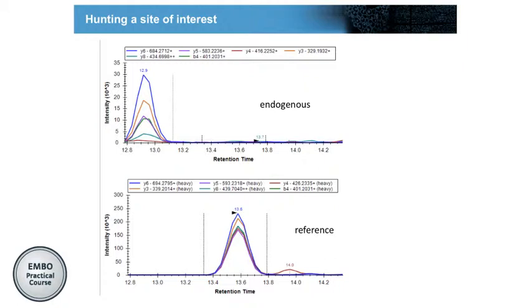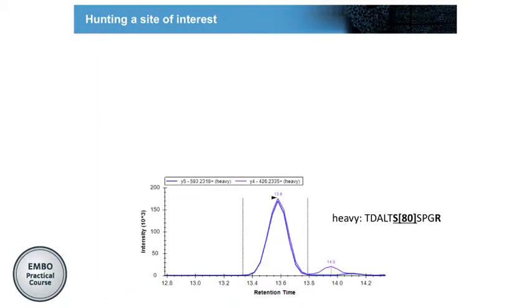The site is located here. The reference peptide tells me that this is the site. This peptide tells me something else. If you just look at a sequence, which Y ions do I need to look at to know where the site is? Is it on this one? Is it on this one? Speak up. Y5. Is it the only one that I need? Y4 and Y5. Very correct.